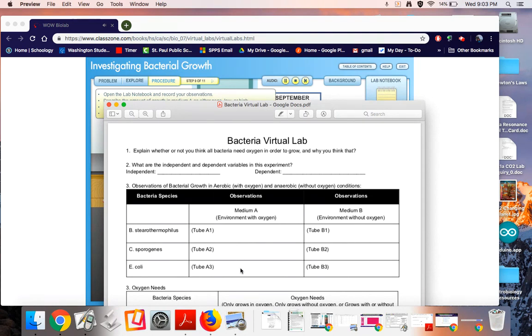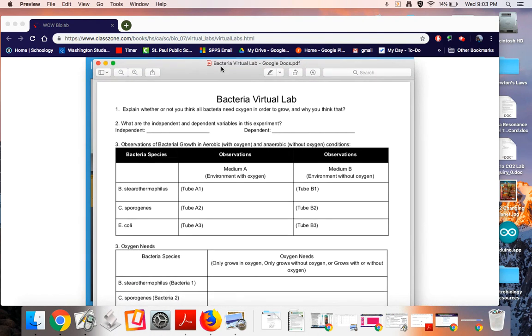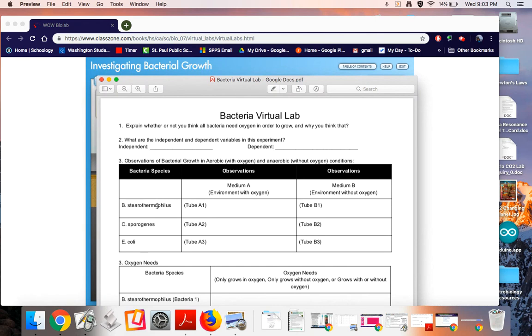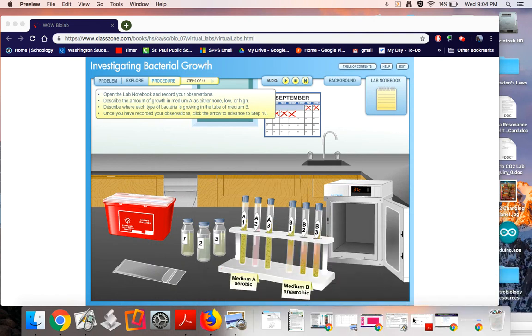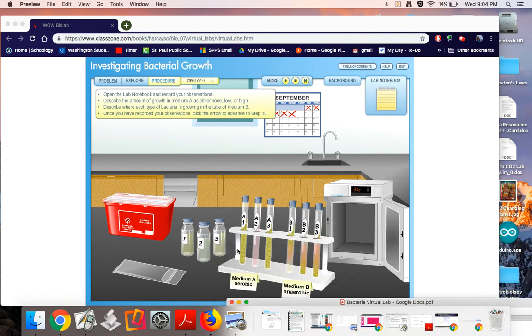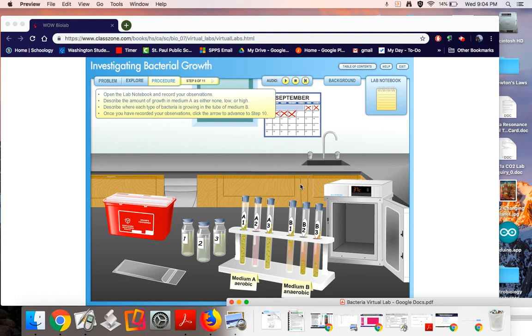Okay, so you can use the words low, medium, or high. So we've got three different types of our bacteria and we've got tube A1, A2, and A3, B1, B2, B3. So low, medium, or high. Let's just take a look at what we've got here. So I want you to just write down what type of growth bacteria there is in each one of these test tubes. Notice here location matters, so I'd also like you to write if it's at the top or at the bottom or both the top and the bottom. Okay, so go ahead and pause this video to write down your observations.